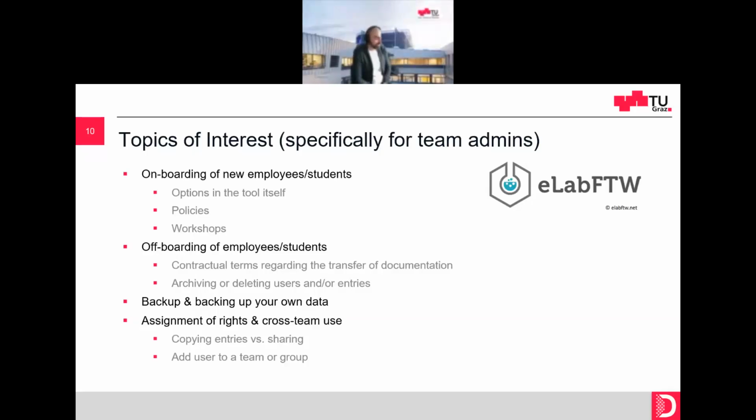Then also backup. I mentioned before that because it's an institutional solution, backup is managed by TU Graz. So the instance itself is backed up, but it is also always a good idea to have some backup of your data, of your entries, from time to time on an additional device. There can always be some disasters, and if you have something really crucial, it's always a good idea to have the most important parts stored somewhere else. It's just something I want to mention. So there is some self-responsibility here as well.